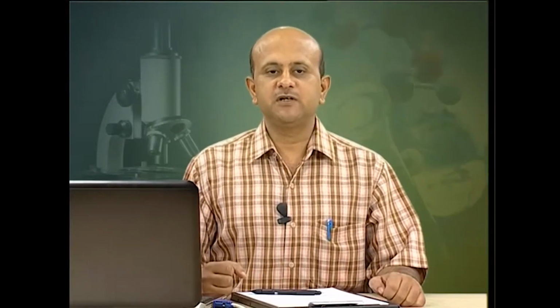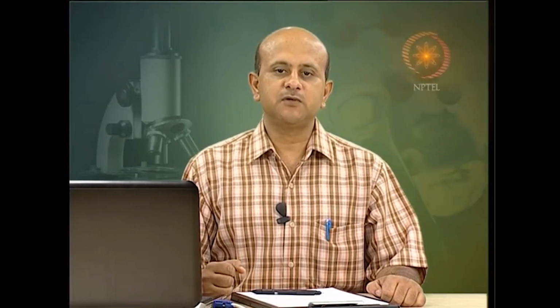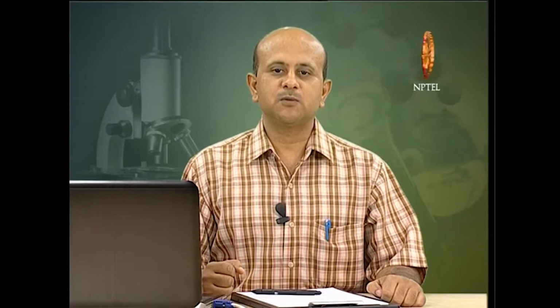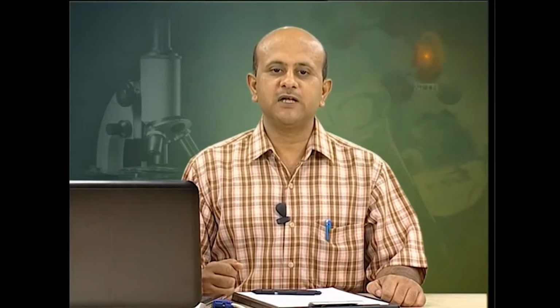Now, one of the examples we will take here of a continuous flow rotor is the elutriator rotor. The elutriator rotor is like an elution type of rotor, you can say. This is a type of continuous flow rotor, and it contains a single conical shaped separation chamber. In this separation chamber, the apex points away from the axis of rotation, and there is a bypass chamber on the opposite side of the rotor, which serves as a counterbalance and also provides the fluid outlet. So, on one side there is a fluid inlet and on the other side there is a fluid outlet, and it is also counterbalancing the other side.